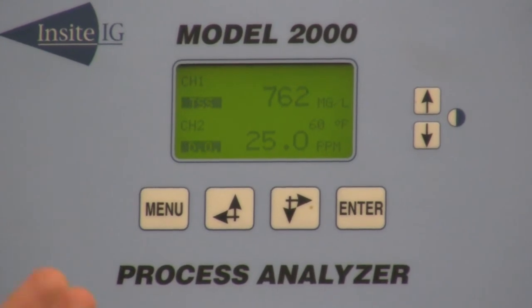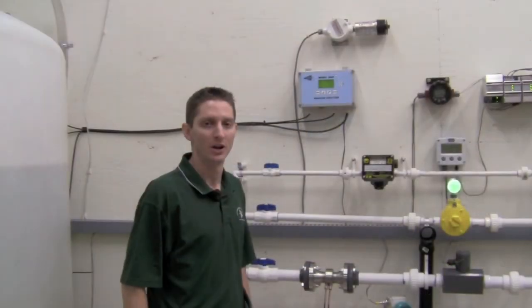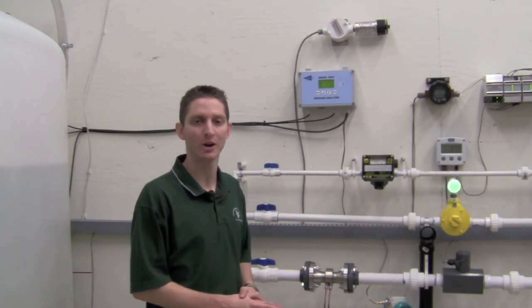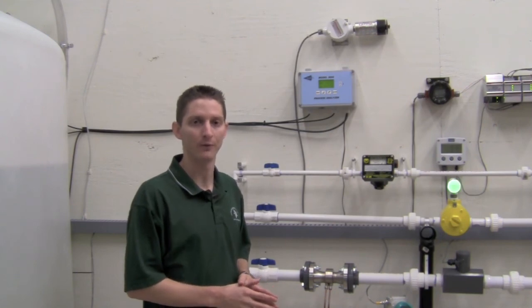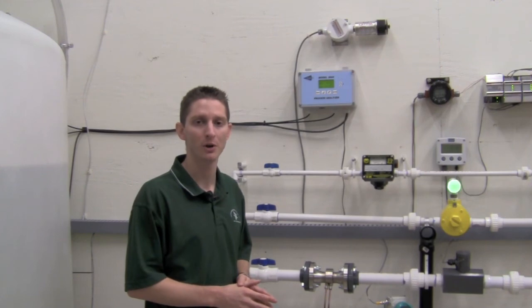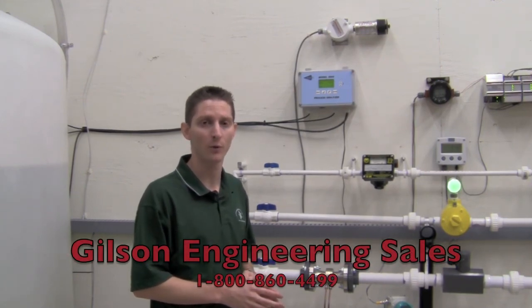Once you do that, come back to your main menu and go to run mode and you're measuring. That's all there is to it for the setup and installation of an Insight monitor — it's a true plug-and-play device. If you have any questions or need any other assistance when you go to set yours up, feel free to give us a call at 1-800-860-4499.